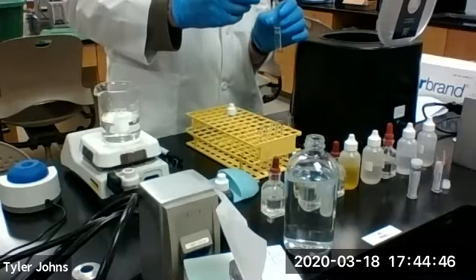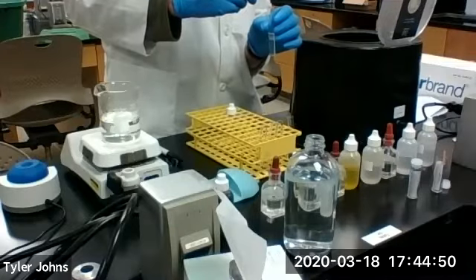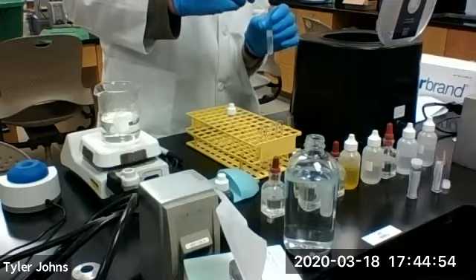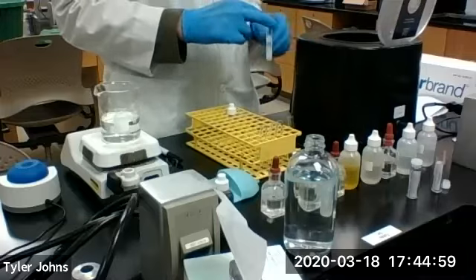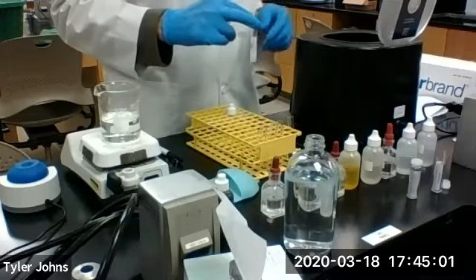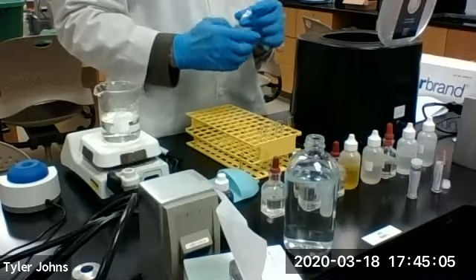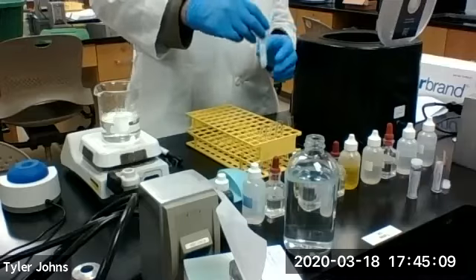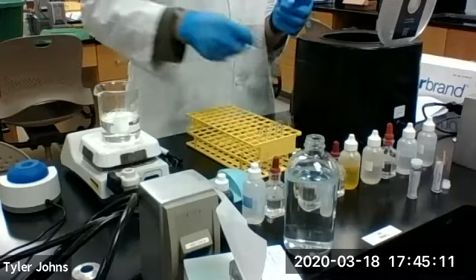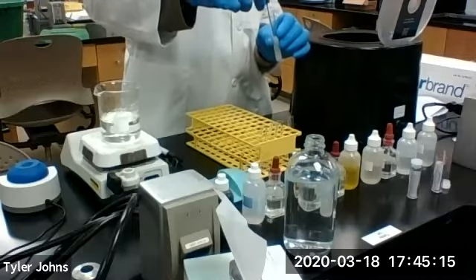So half a milliliter of this. We will stir this over a period of 5 minutes.